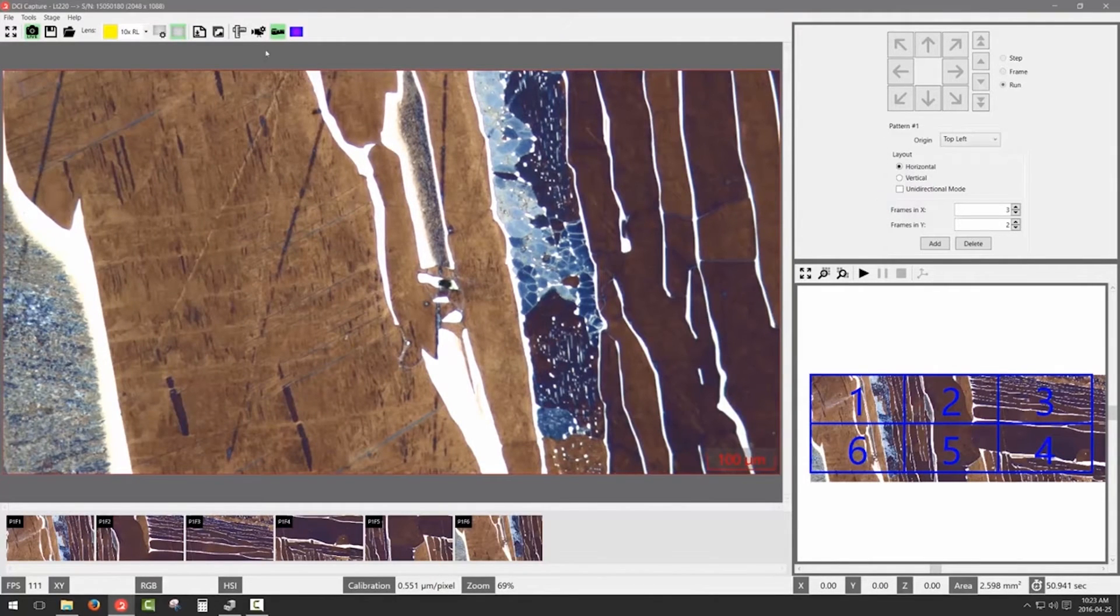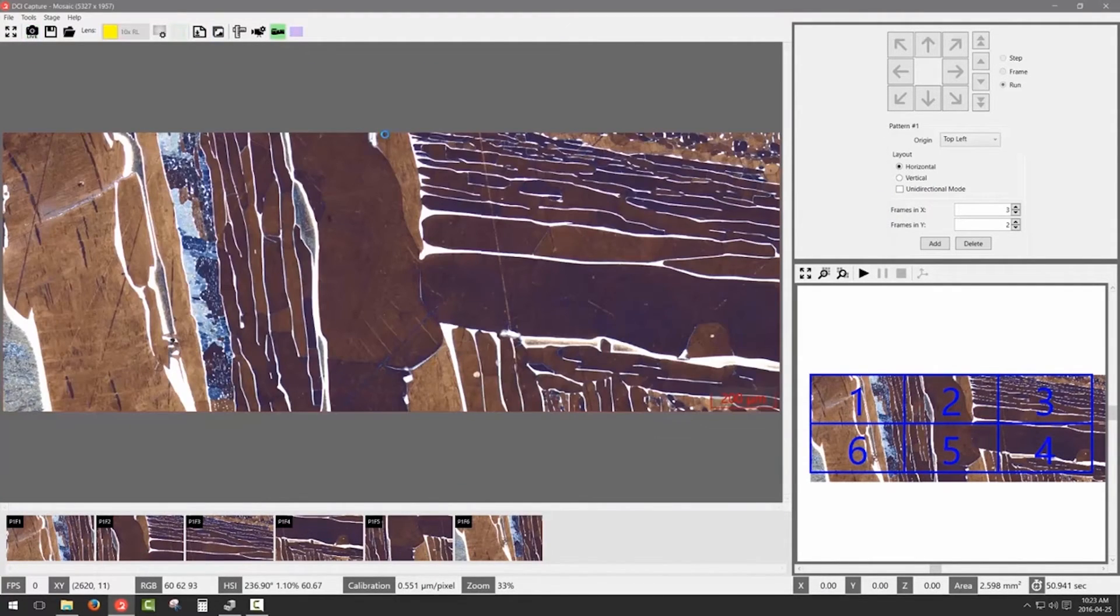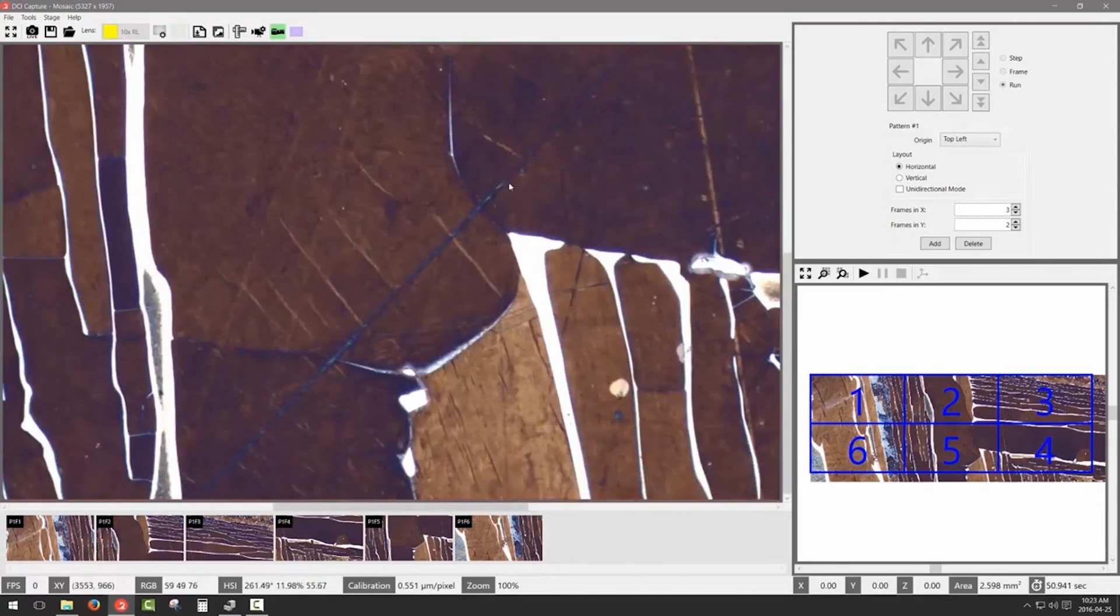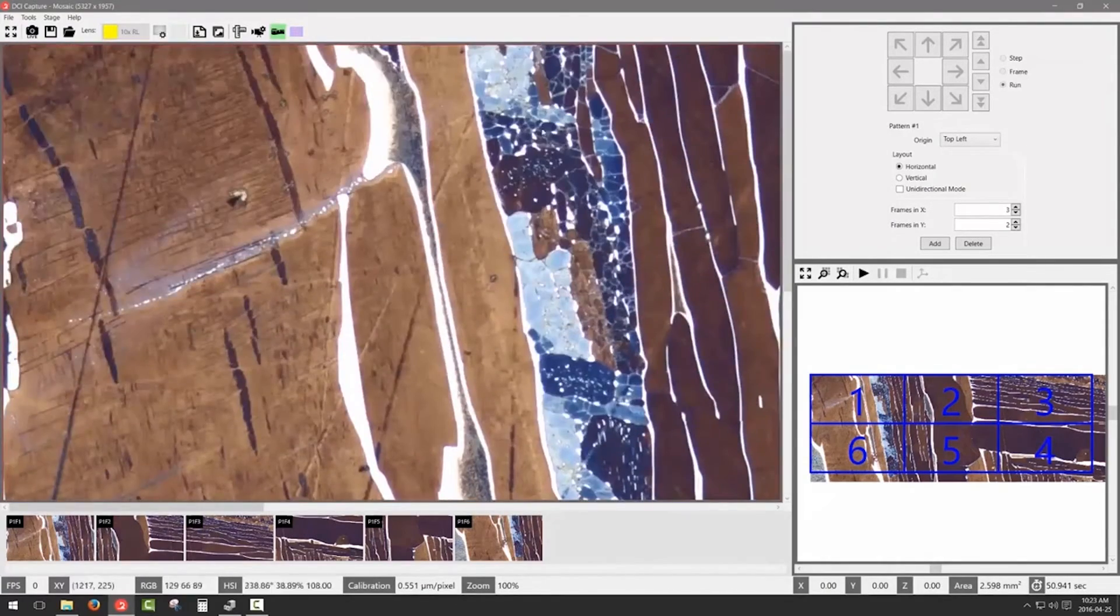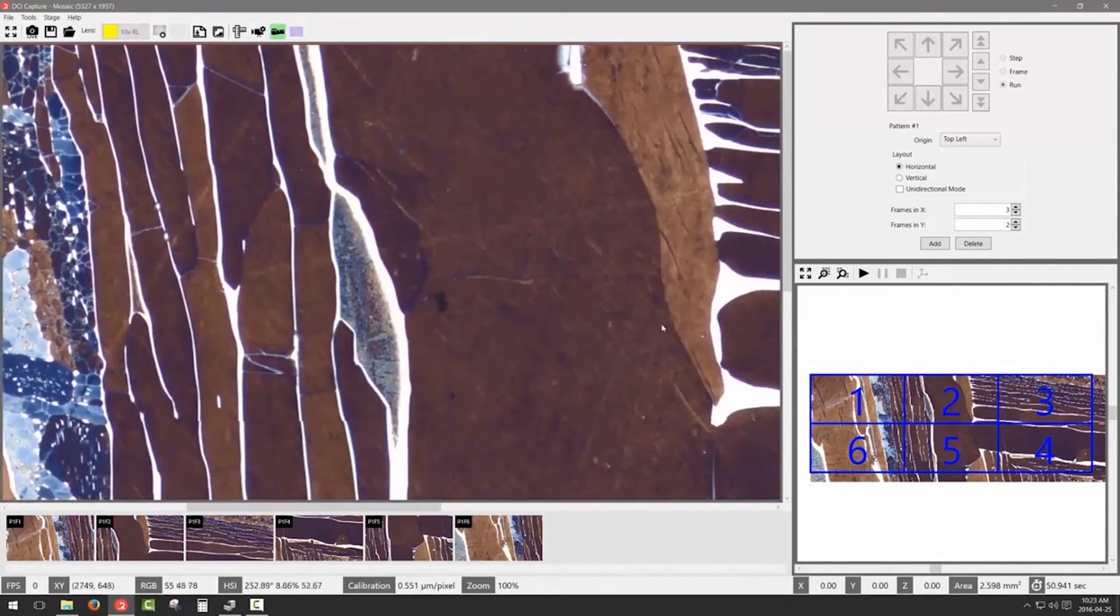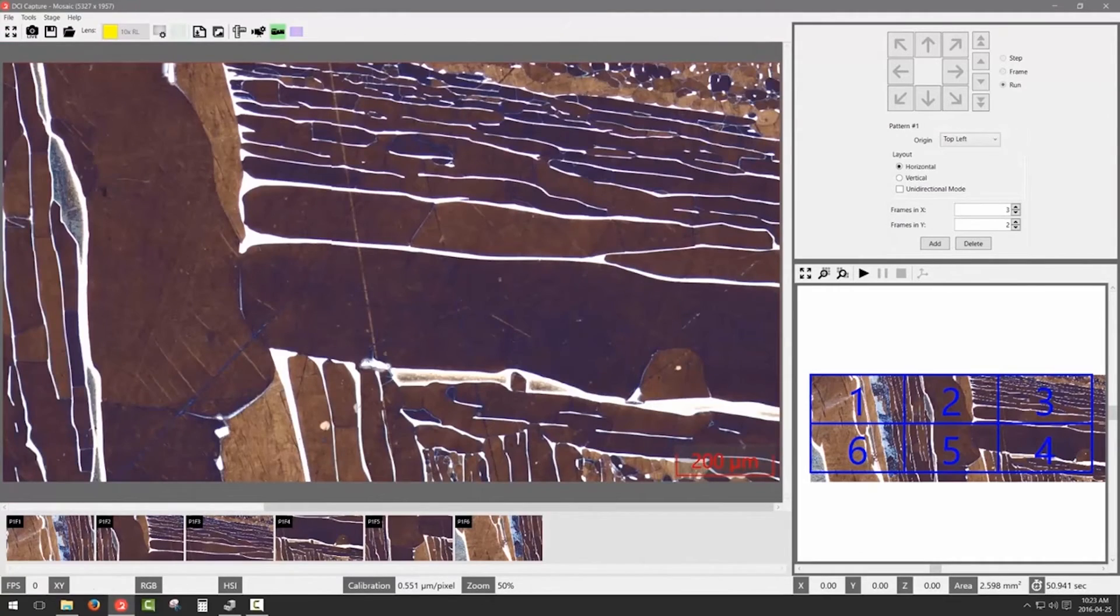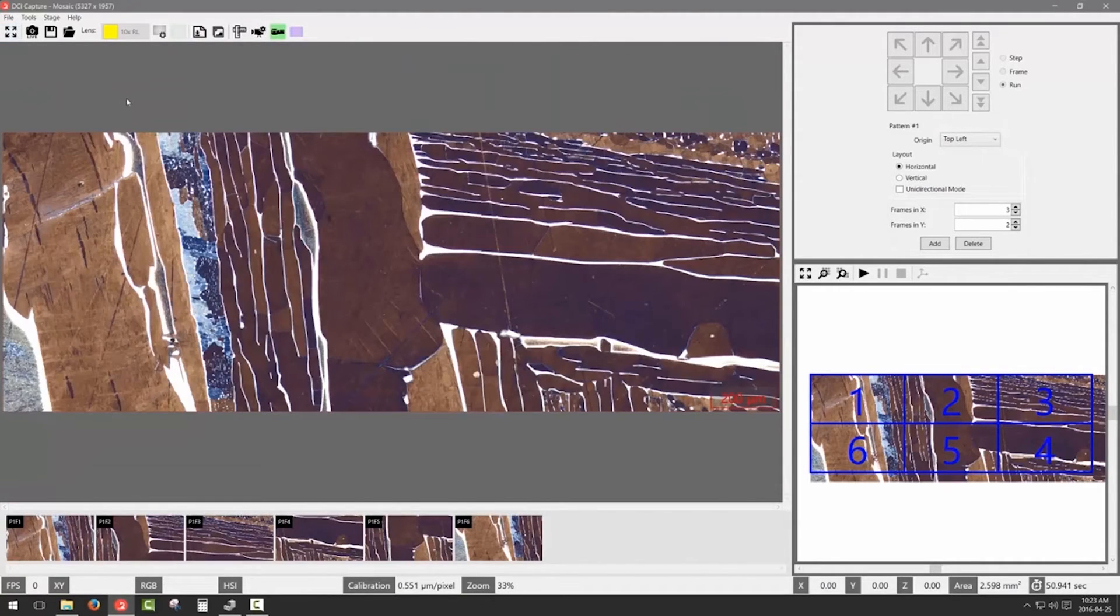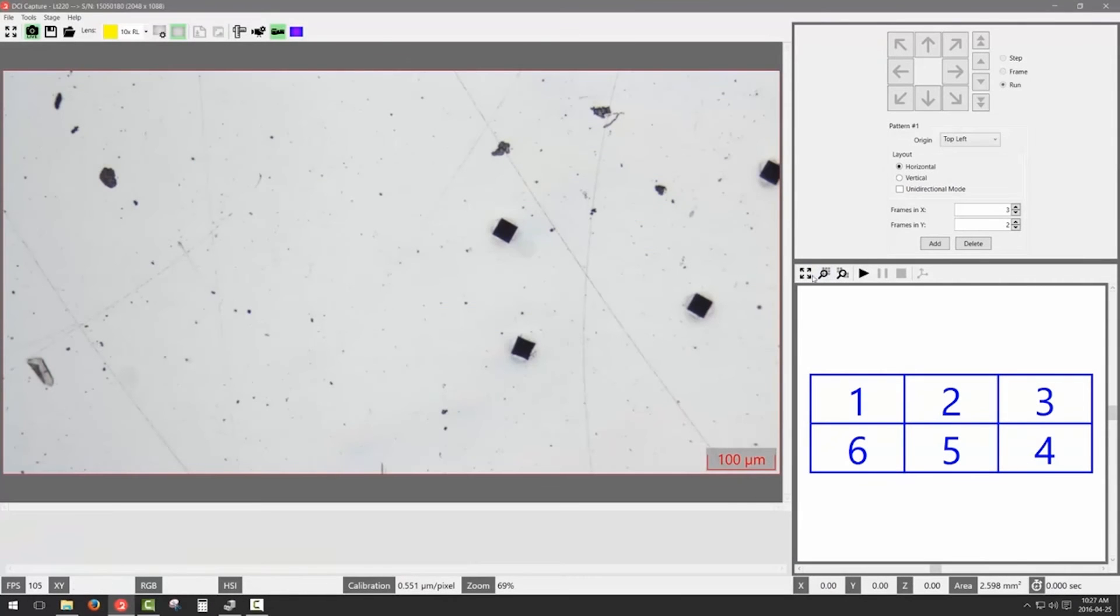Once you are done, simply press the build mosaic button. You now have a full resolution tiling of six fields, greatly increasing your field of view on a sample in a very cost-effective way.